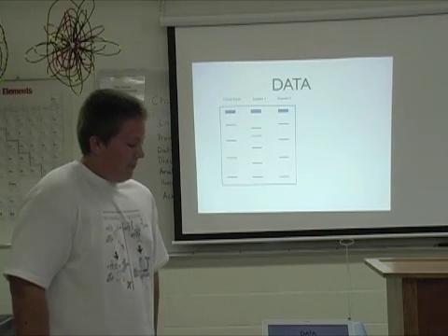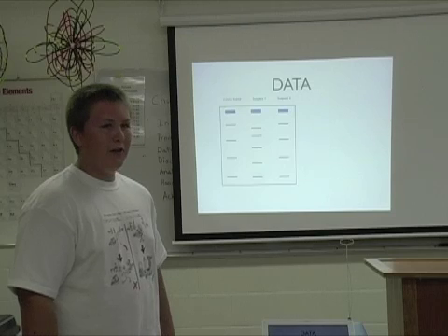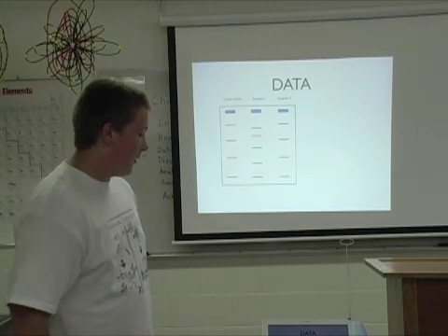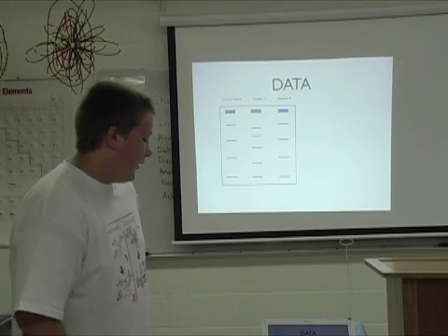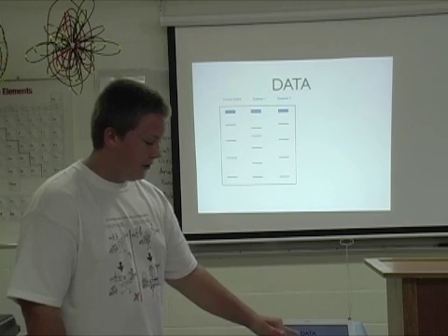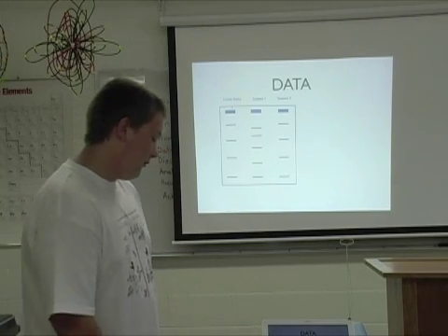And I would have taken a picture, but our sample was kind of iffy. We couldn't take a good picture of it, but we could see it fine, so I made a replica of it. And we can see that the crime scene DNA has 4 bands that all match up to suspect 2, but suspect 1 has a lot of different ones.